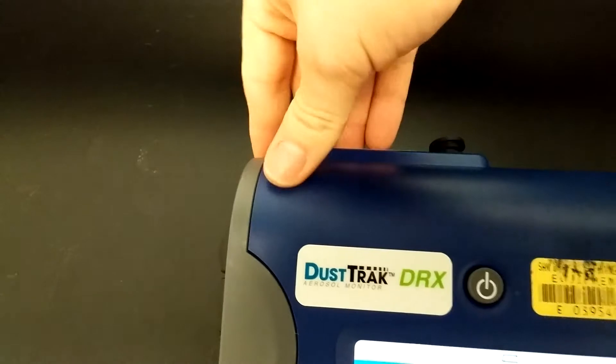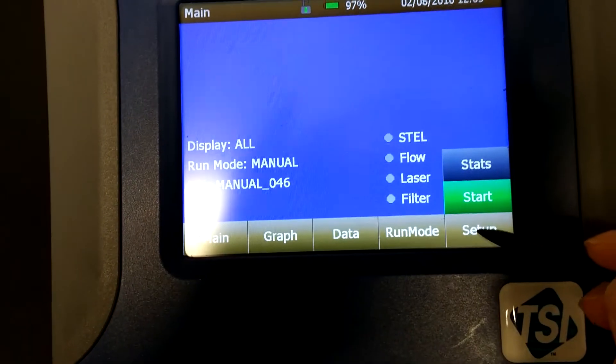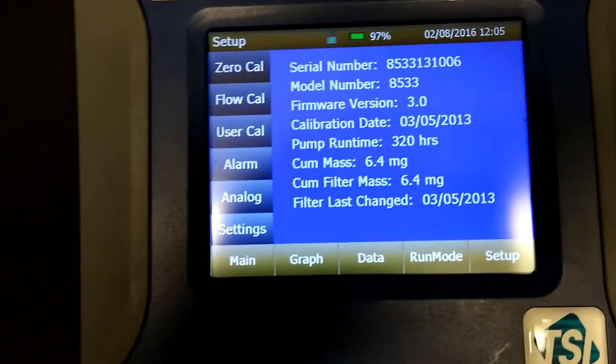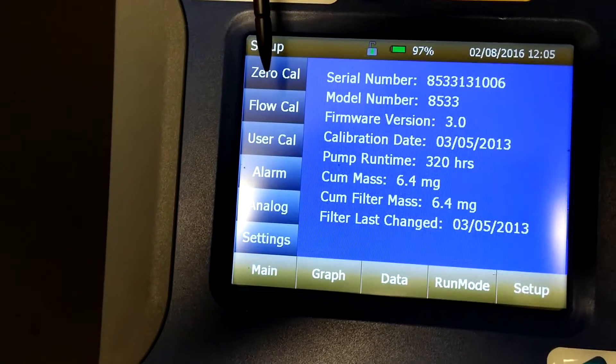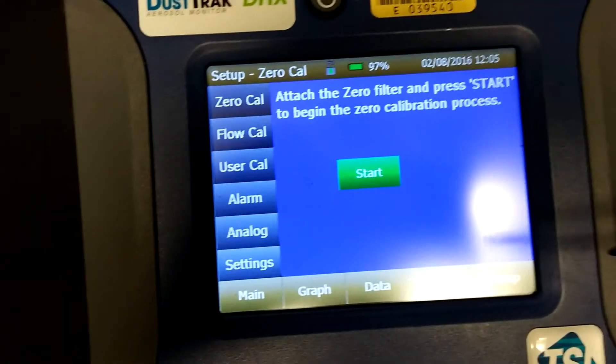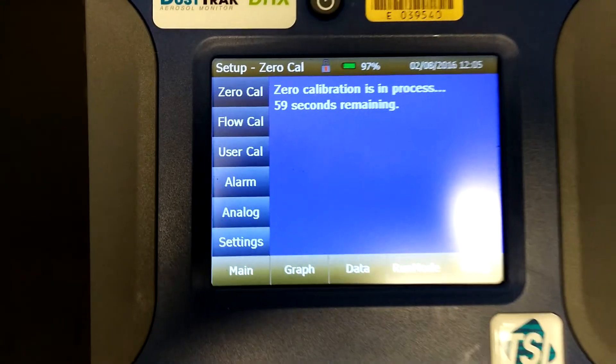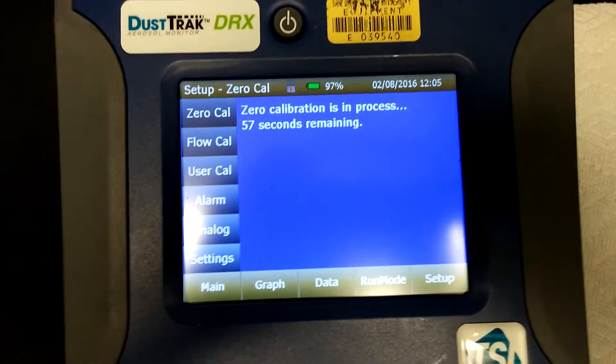Once you have the zero filter attached, take the stylus, go to Setup at the bottom right, go to Zero Cal at the top left, and then click the Start button in the middle. This will start a 60 second calibration.